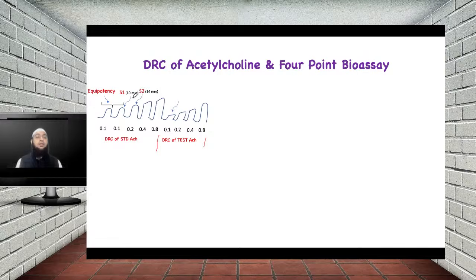If that is there, then you can select S1 and S2, or you can go ahead with 0.2 or 0.4 ml. Okay, so this is how you are going to select S1 and S2. Now since there is very good gradation between the 0.1 ml dose and the 0.2 ml dose, the 0.1 and 0.2 ml doses of the standard itself you are selecting as S1 and S2.